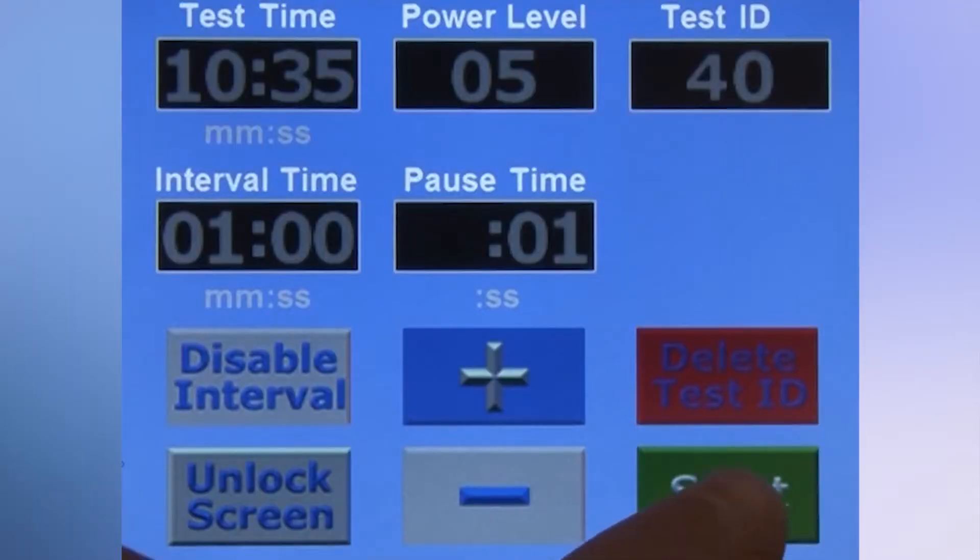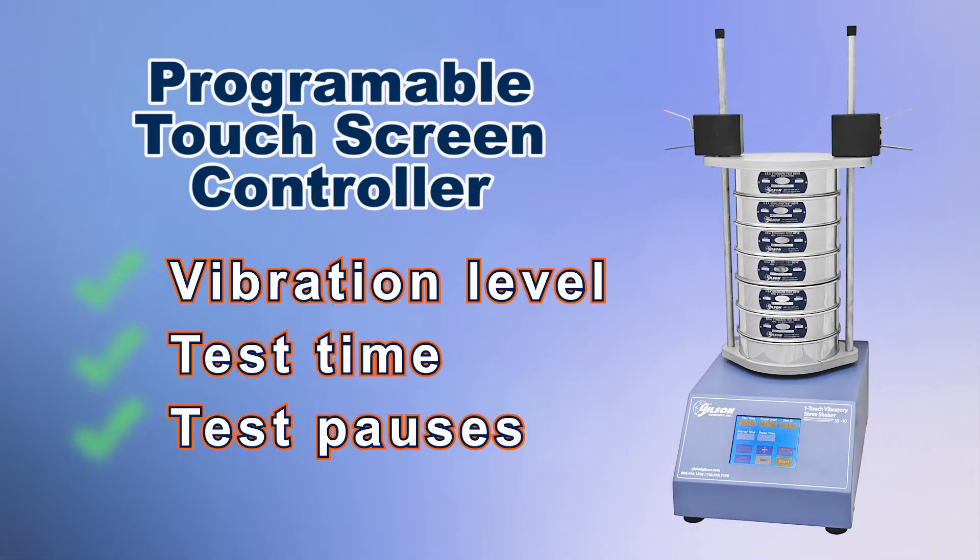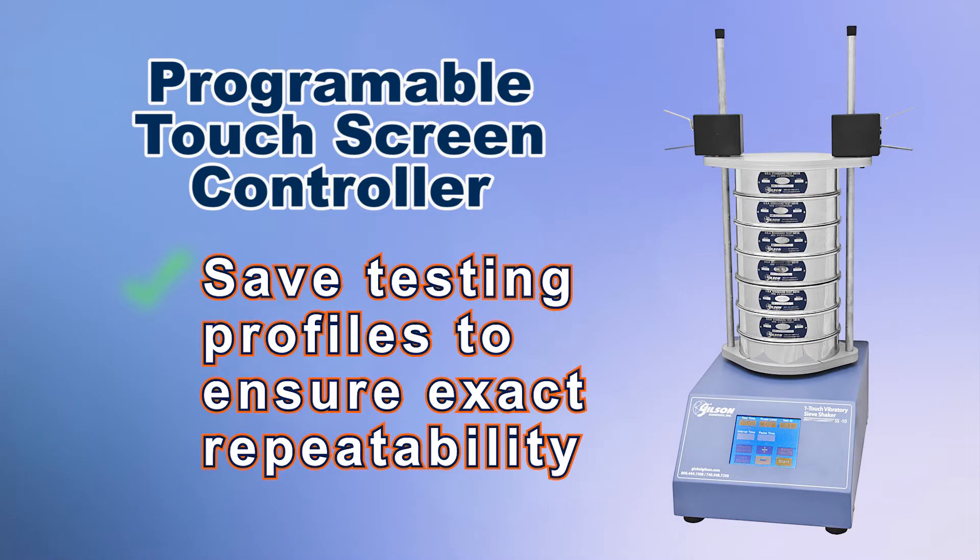To ensure optimum sieving performance, the Gilson Programmable Touchscreen Controller allows users to select precise operational times, vibration levels, test pause, and the capacity to save up to 99 testing profiles.